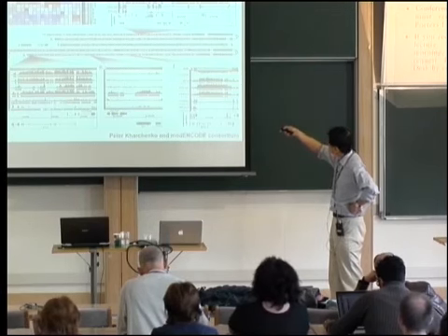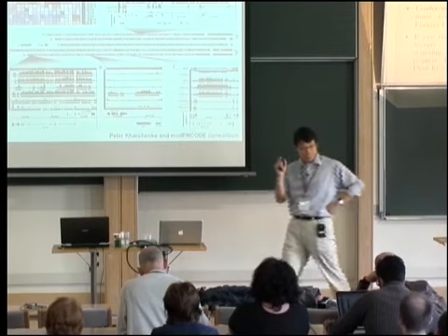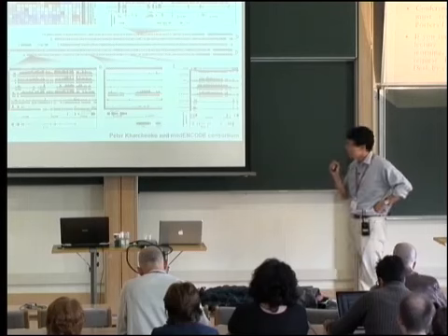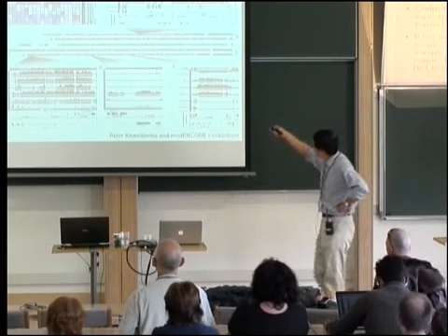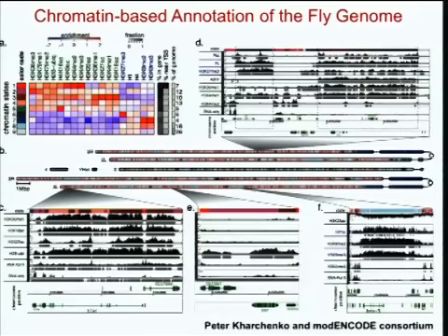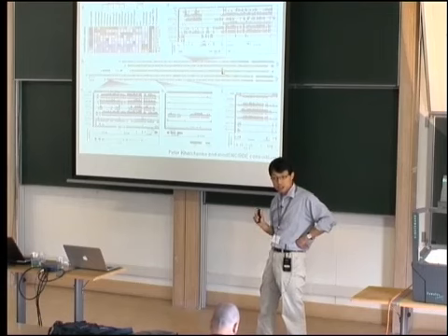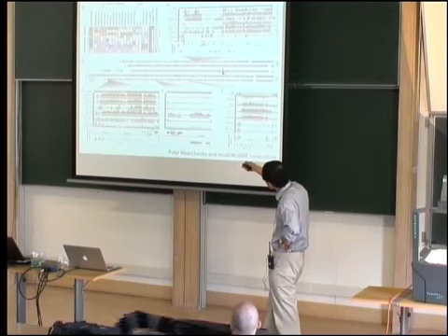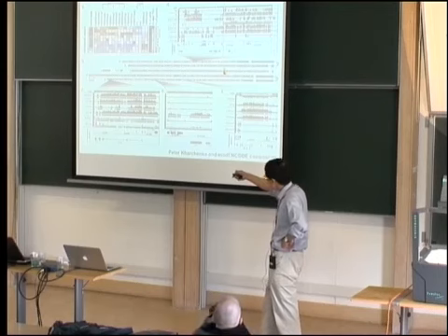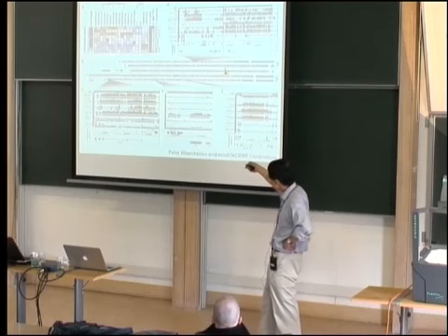Let's say, for instance, the X chromosome, in fact, on my screen has a slightly different color because it has a lot of H4K16 acetylation mark. Okay? This particular region corresponds to polycomb related factors. There is really a lot of binding of those factors on those regions. And so I can look through and see where those chromatin states are. There are certain regions, so these are 2 regions that, again, it's hard to tell, but there's an RNA-seq profile that are both expressed.